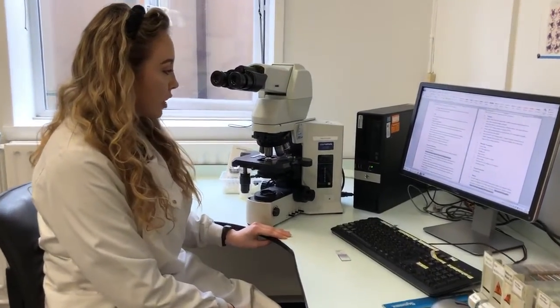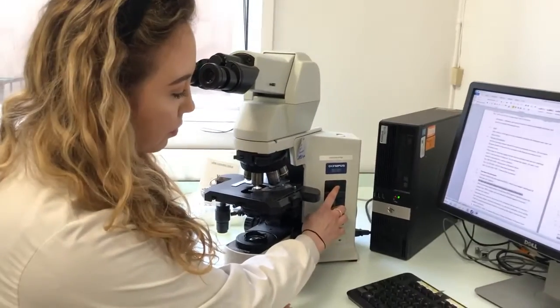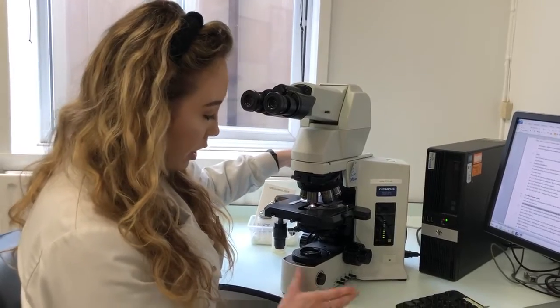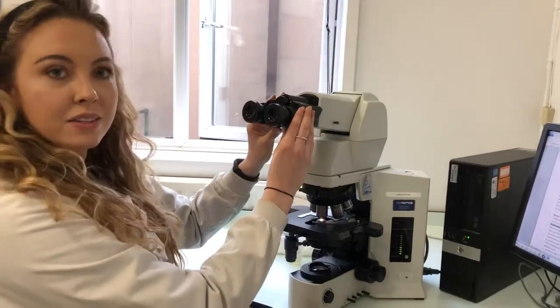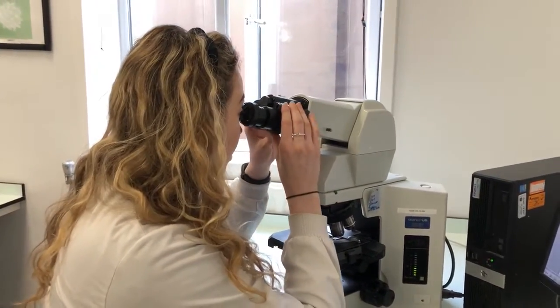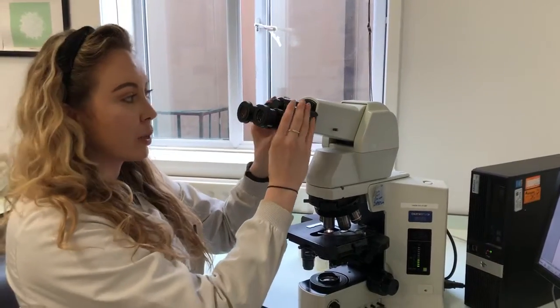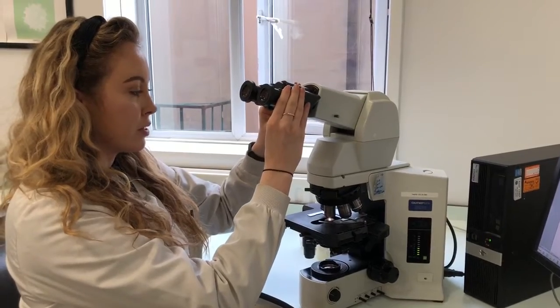So to begin with, I'll show you the power switch. The power switch is over here to the side and we'll turn that on. Broadly speaking, the microscope can be divided into three pieces: the head piece, the body and the base. So at the top here, we can look at the eyepiece. This is where we look down into the microscope. We can adjust this to fit our own eyes. I suppose everyone has different shaped faces, so we can adjust this as we need to. So this is where we look down, and this is our eyepiece.